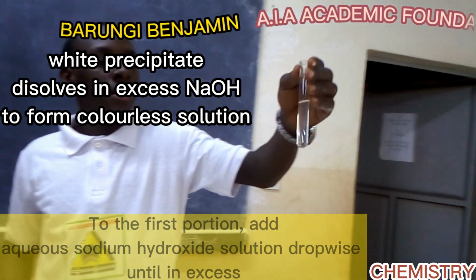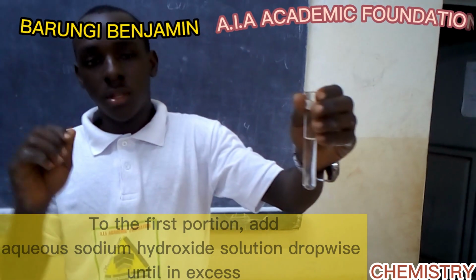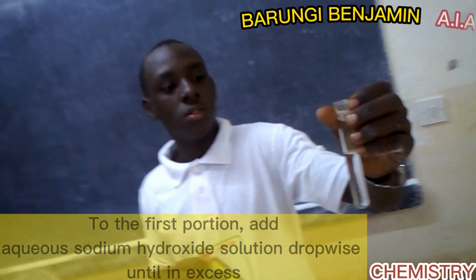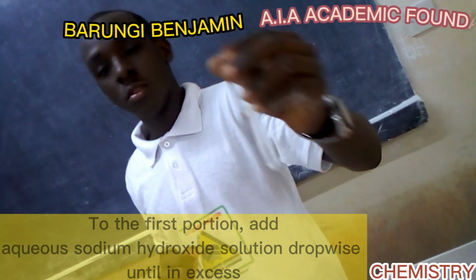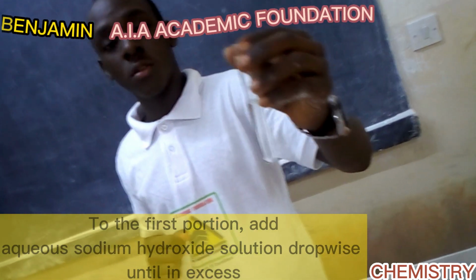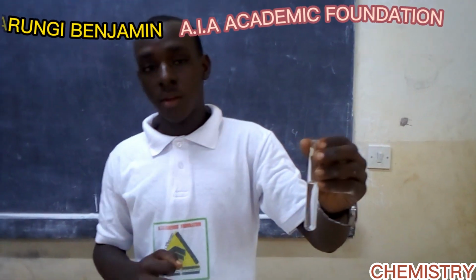What does this show to us? It shows that there are 3 cations that usually form a precipitate with sodium hydroxide, and the precipitate is always soluble in excess. That is zinc ions, aluminium ions, and lead 2 ions.